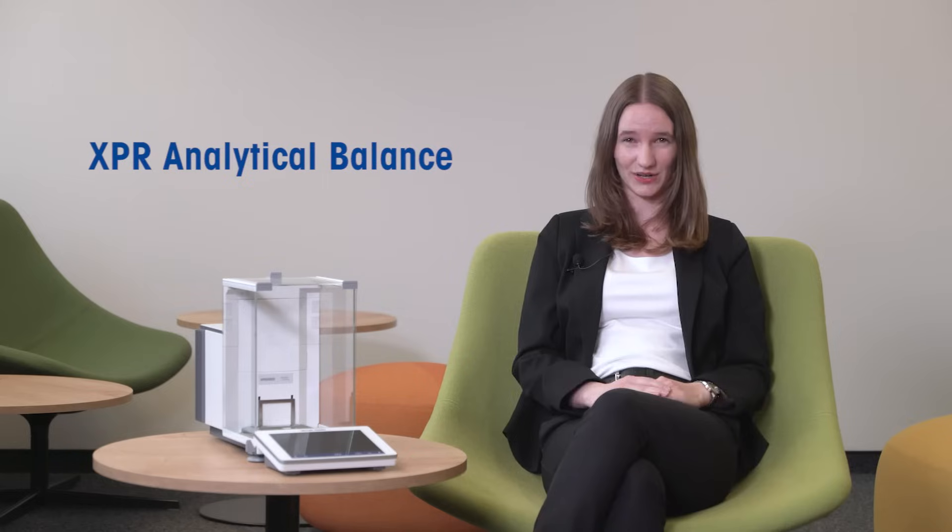Hello and welcome to this product demonstration. What you have just witnessed is the newest generation of Mettler Toledo's excellent analytical balances, the XPR. Now let me show you what makes the XPR so exceptional.